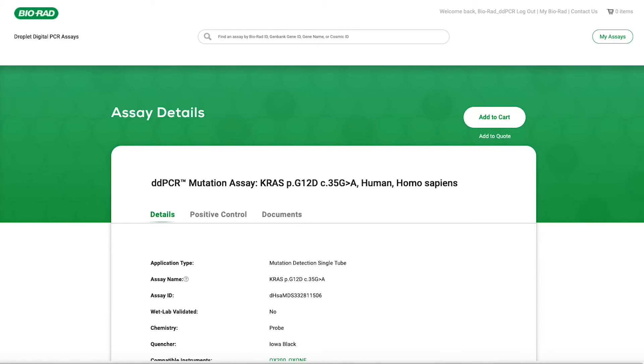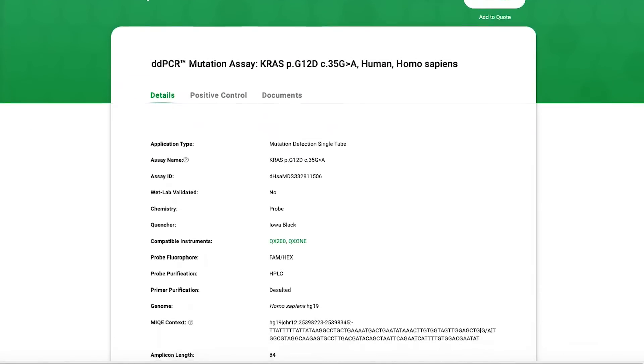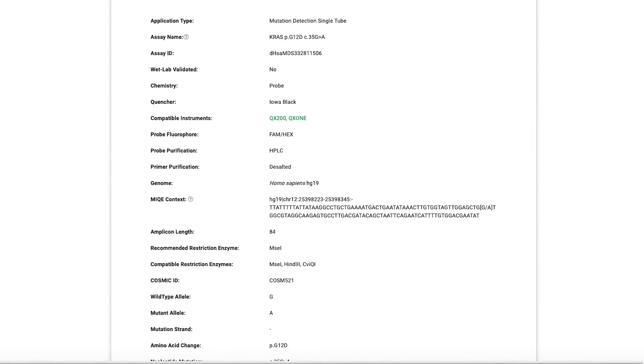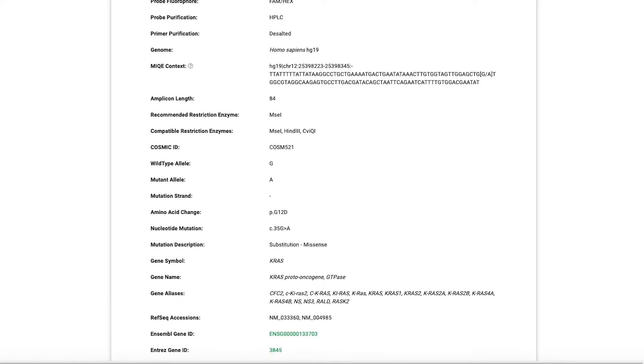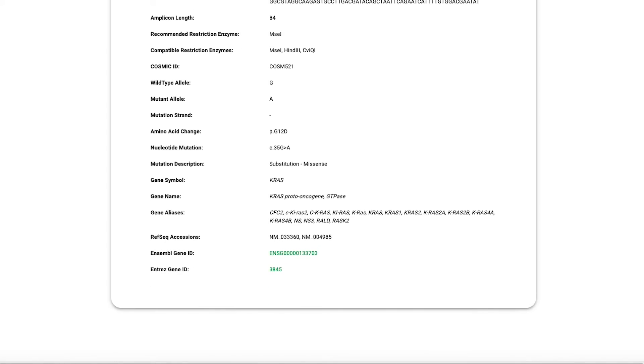The design engine considers GC content, primer melting temperature, primer placement, probe length, and genome specificity when designing an assay for you.